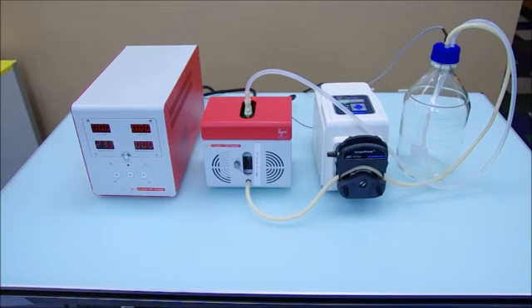The X-Clarity system is the first commercially available electrophoretic clearing system and eliminates many of the challenges from trying to create your own system and can provide cleared samples in as little as 48 hours for whole mouse brains.